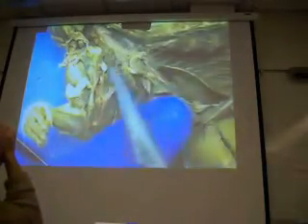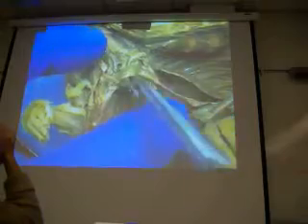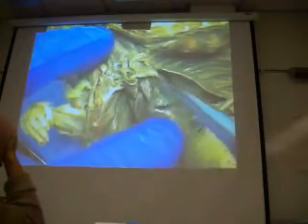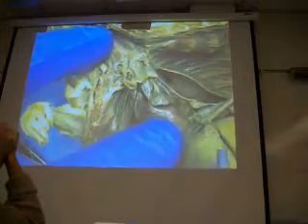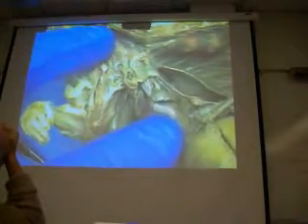And then on this one, what you can actually see is the aorta. Oops, let me move this out of the way a little bit. Oh, you guys can see it very well. There's the aorta coming out right through here. This is the aortic arch. It's going to bend in that direction, right? And so what I'm going to do is, I'm not going to go over all these vessels today. I'll just wait to go over the vessels on Monday with you guys, okay?